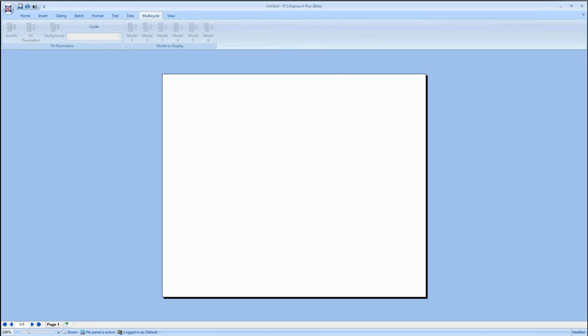I just wanted to introduce you to Multicycle real quickly since we'll be looking at cell cycle data. For those of you who aren't familiar with Multicycle, it's a cell cycle analysis modeling tool that is sold by Phoenix Flow Systems. We've partnered with Phoenix Flow Systems many years ago, and we can do Multicycle-based cell cycle analysis within FCS Express. So essentially we're using this Multicycle add-on in FCS Express to do the cell cycle analysis.